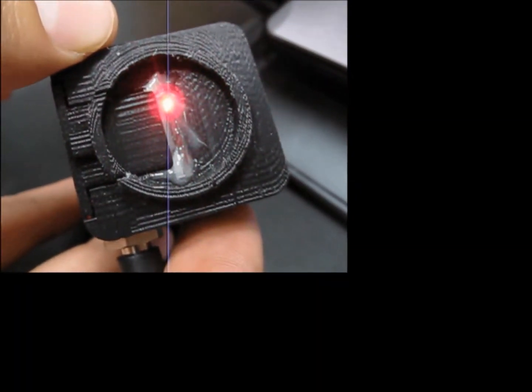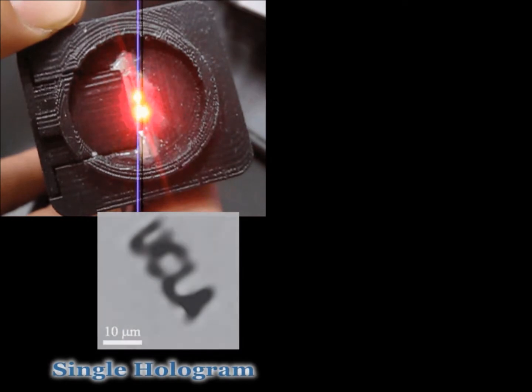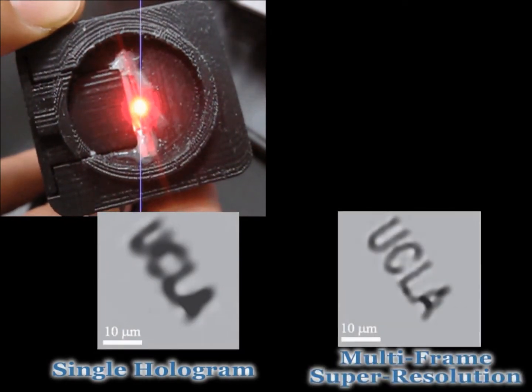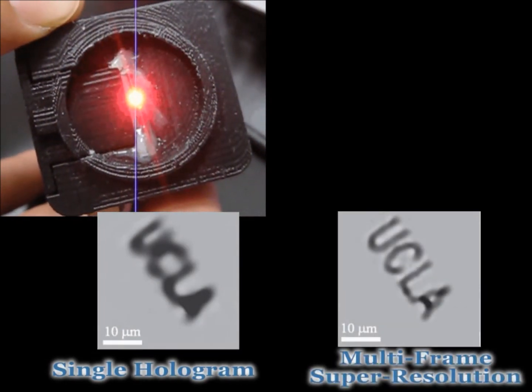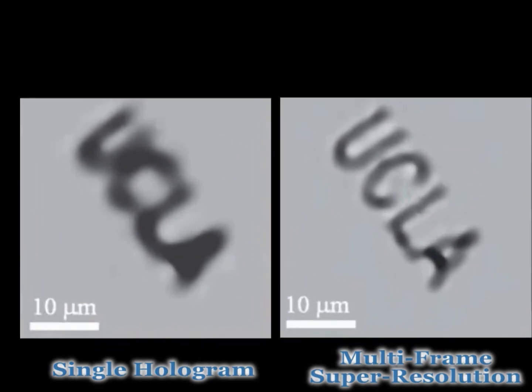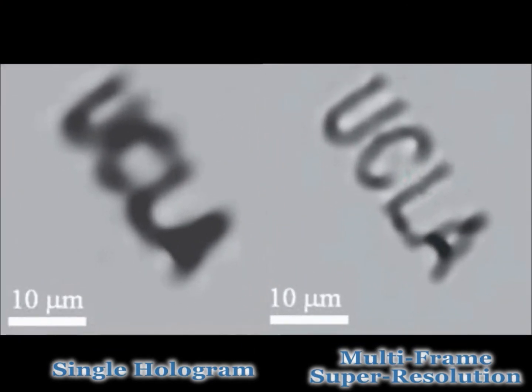The way we capture different holograms is by turning on different LEDs in our device. Each single hologram would give us the UCLA pattern image on the left, but combining them together with pixel super resolution gives the finer image on the right.